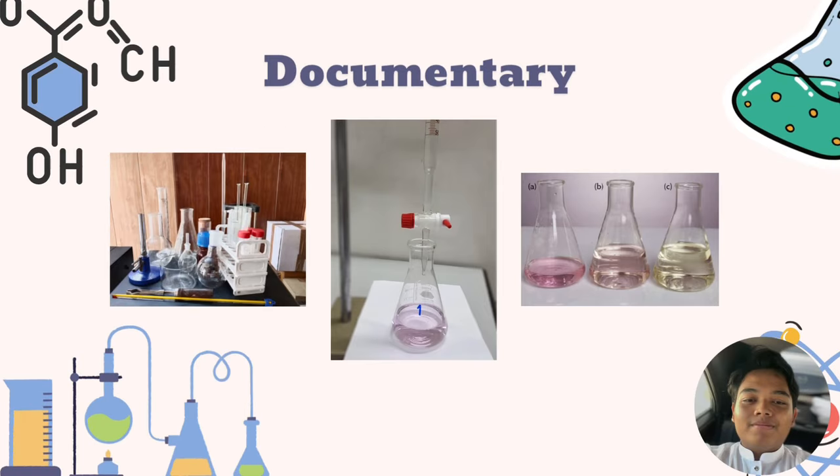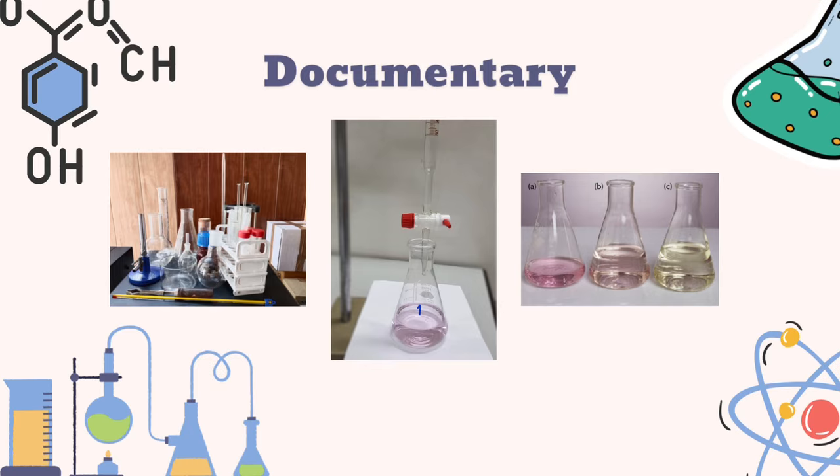On this slide, I will explain these three pictures. The first picture is the lab apparatus. The second one is the titration process. And the last one is the result of the titration.